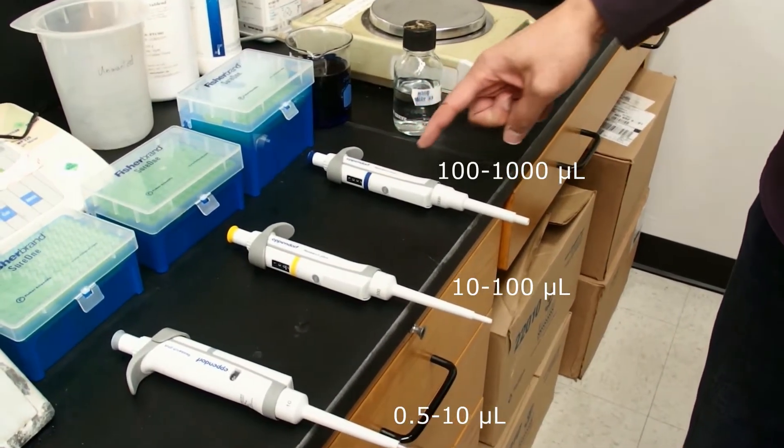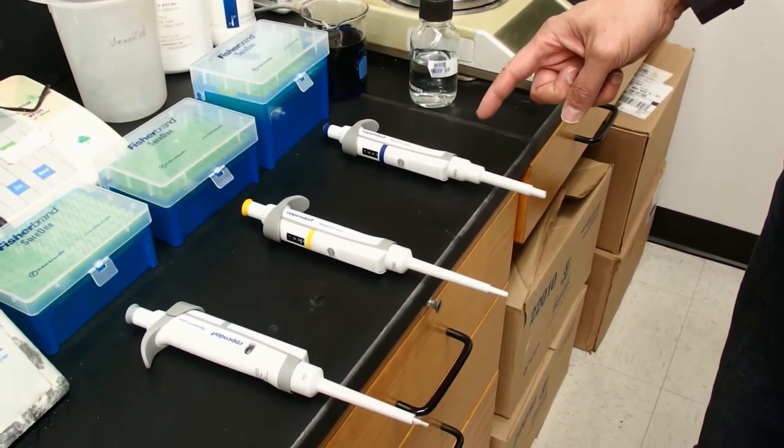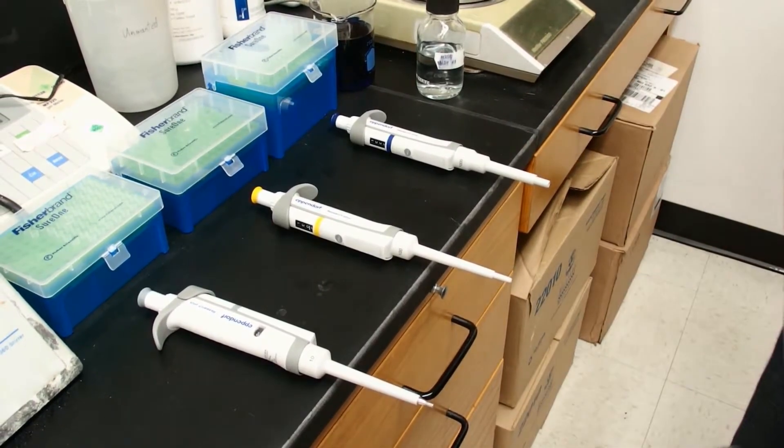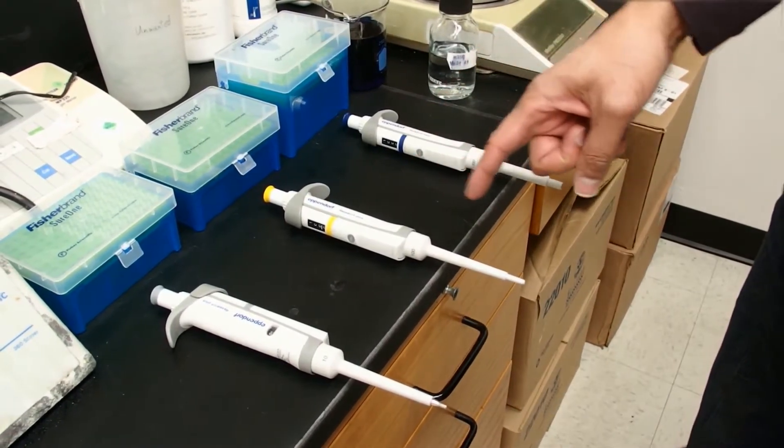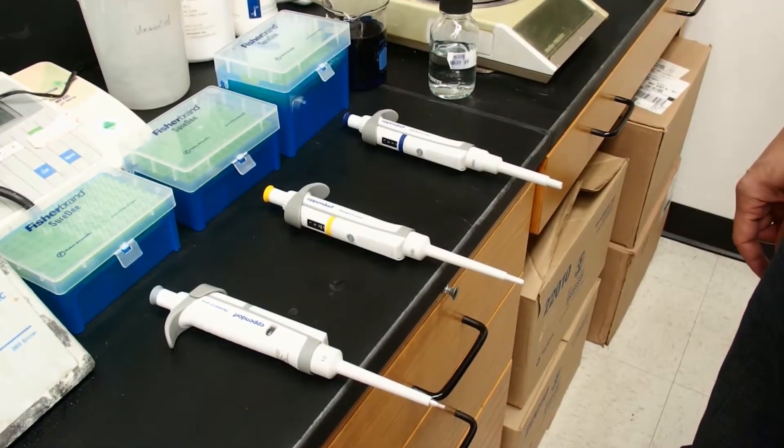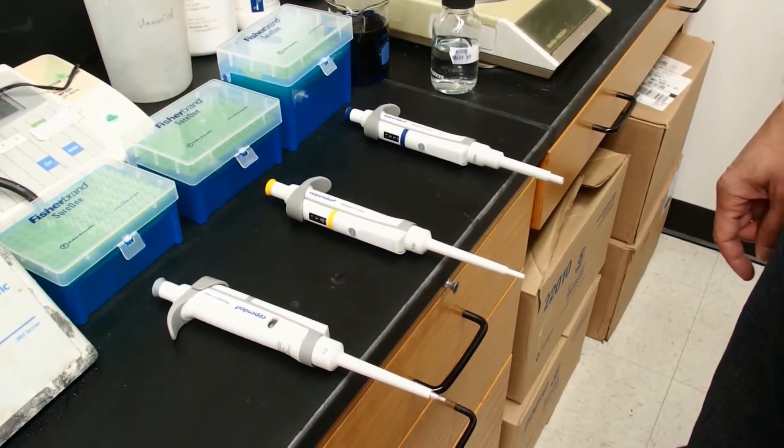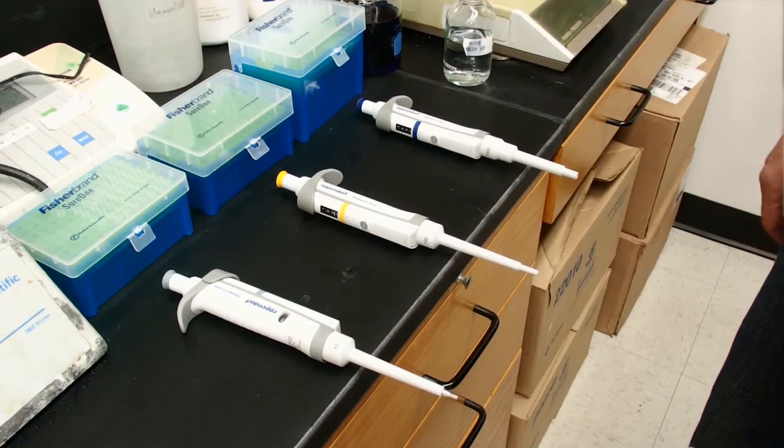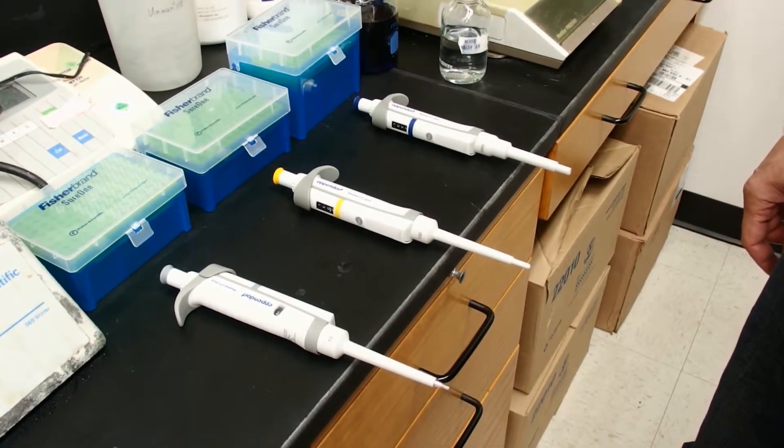Here we have a set of three different Eppendorf micropipettes that each pipette a different volume range. The P1000 pipettes between 1,000 microliters and 100 microliters. The P100 pipettes between 100 and 10 microliters. And the P10 pipettes between half a microliter and 10 microliters.